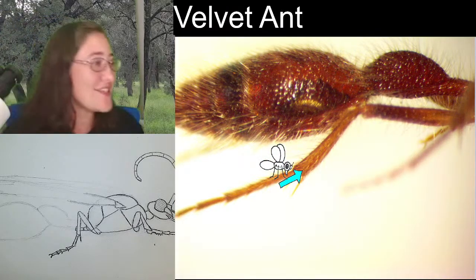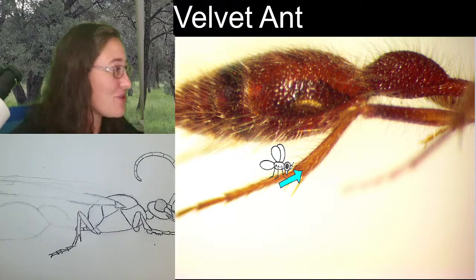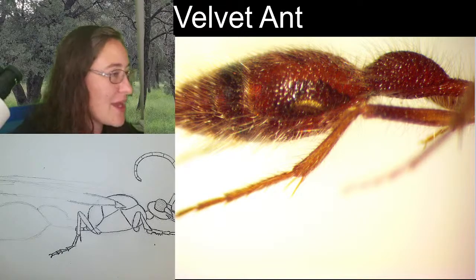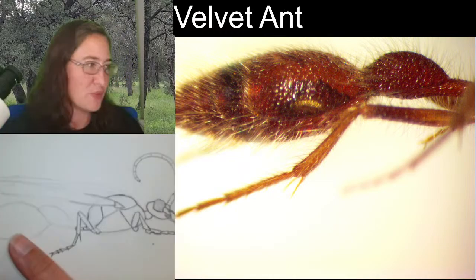We can see the felt line so well! I'm so excited! I'm going to show you a velvet ant felt line. I don't think we saw it last time, because it was too hard to see through all of the really fluffy hair, but we can see it this time, and I'm so excited! Okay.